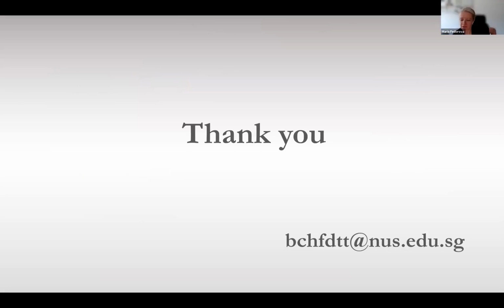Thank you very much, Federico, for the great talk. There is a question from Mangala Priya. I'm going to perform untargeted lipidomics in a diet-induced animal model. For untargeted lipidomics, whether to prefer DIA or DDA?